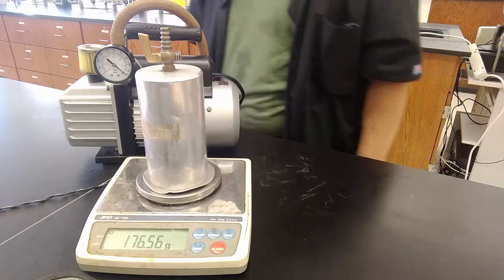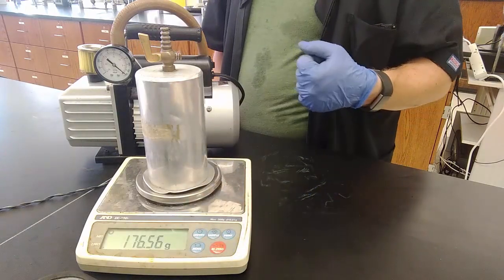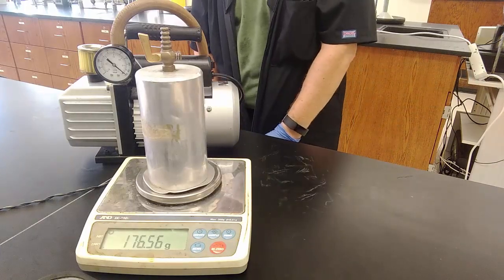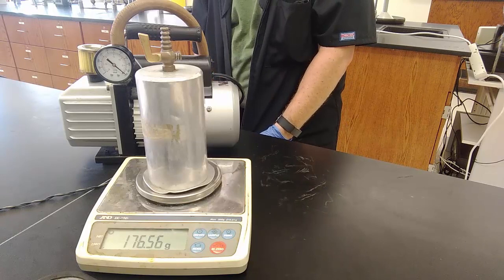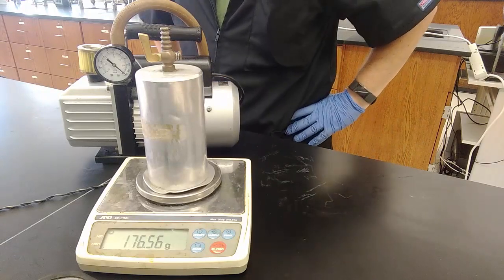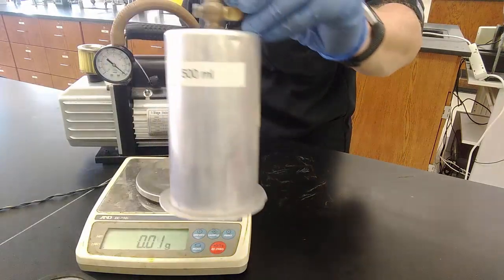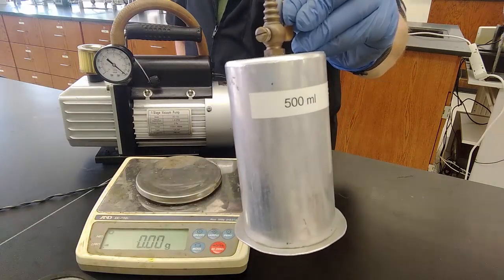I certainly hope so. And if we subtract the mass of the densitometer without air from the mass of the densitometer with air, then we have the amount of air in grams that fills the densitometer. And we can calculate the density since we know the volume and we just obtained the mass.